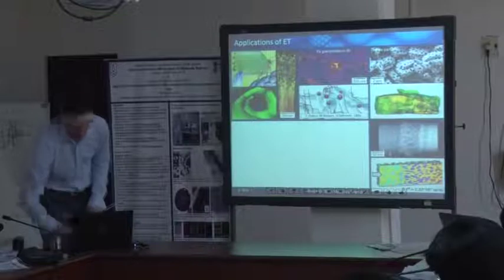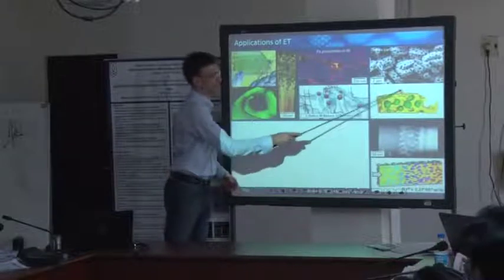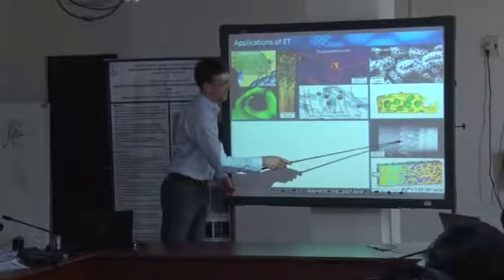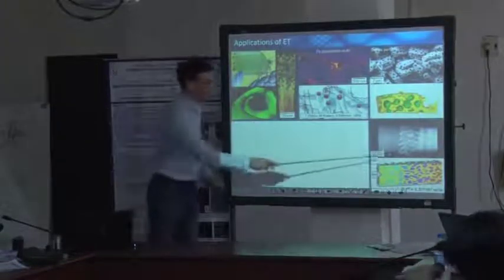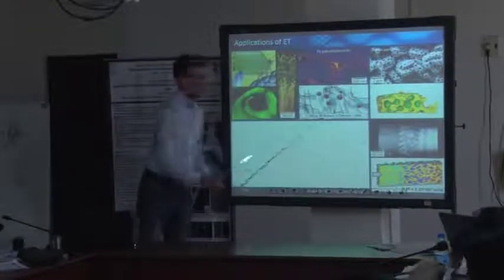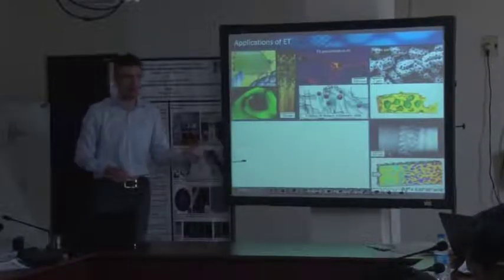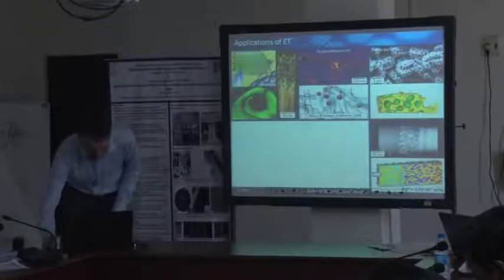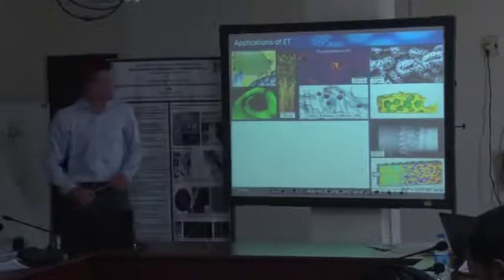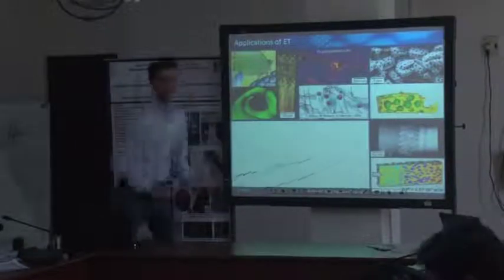These are two examples of nanoparticulate or nanostructured and highly porous materials. This is a particle that you already saw in one of our lectures. And this is a strontium titanium oxide film, an open porous film on a silicon substrate. This is a tilt series. In this particular case, both are used for catalytic applications, and people are interested in the pore size, pore distribution, and pore connectivity, which you cannot get just from a single projection. This is a standard image here, for instance, where you see a chemical contrast between the silicon, the titanium oxide, and another platinum coating.